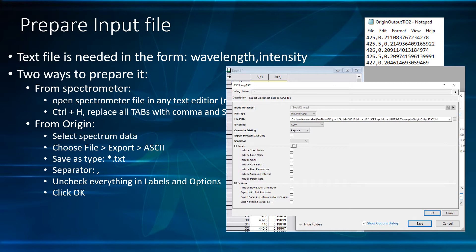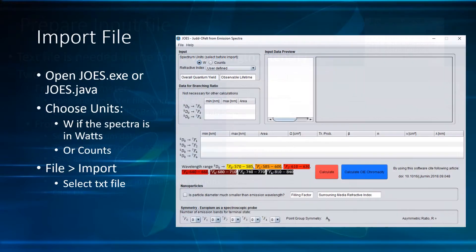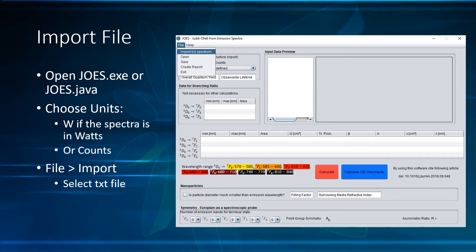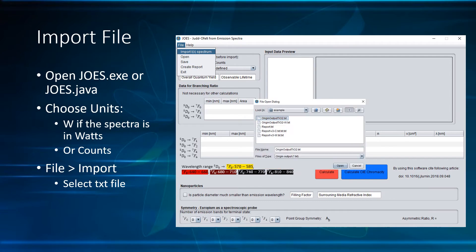We are now ready to work with the JOS program. In Windows, open the JOS .Z file; under Linux or Mac, open the Java file. We are now ready to import the spectrum file. First choose the units in which your spectrometer records — usually it is in counts. To import the spectrum file, click on File, Import Spectrum, and choose the file.